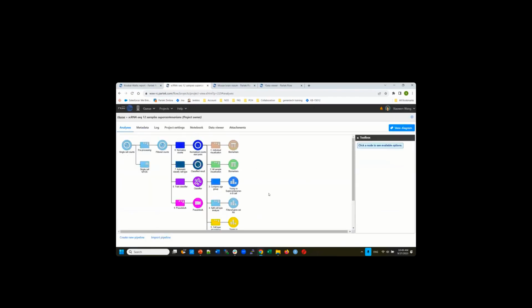Okay. So now, one way to present it is to use a heat map. Again, for the heat map, I want to plot the normalized count. And it's the same thing. You can use your differential expression genes to look at the old versus young. Okay, so I want to use this data node and display those 4 genes at the cell level. You go to exploratory analysis and hierarchical clustering.